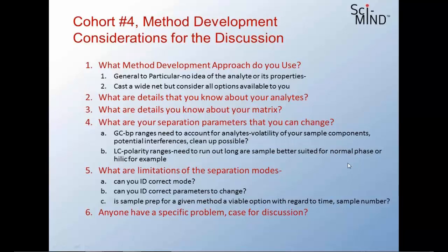Essentially, Nick hit on some really good points about what method development approach to use. It's not something that you could just plan. It's very problem-driven, and it depends on what kind of thinker you are analytically. Going to the chemist and getting as much information as possible are all good points. But your ultimate limit is going to be what options are available to you, in terms of what you have in the laboratory, what instrumentation is available.